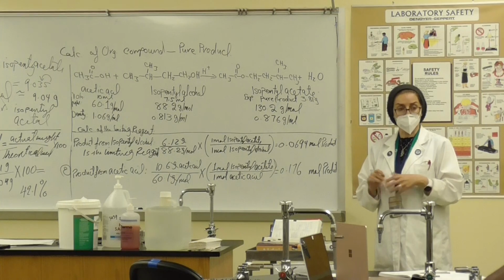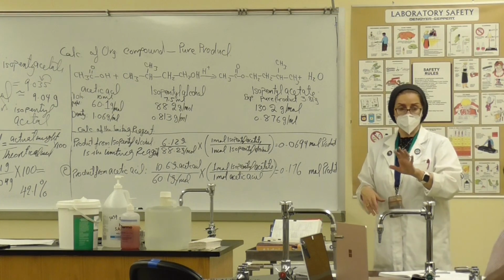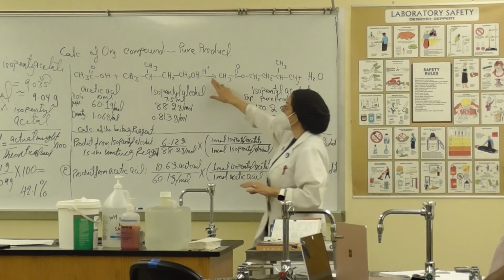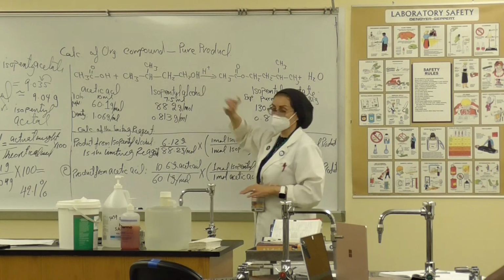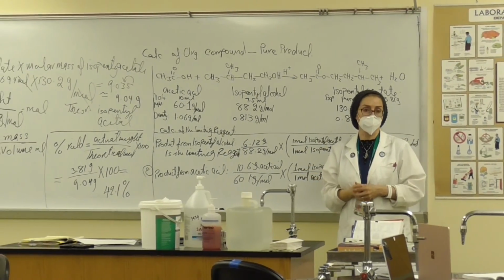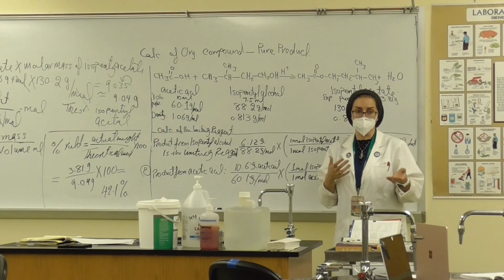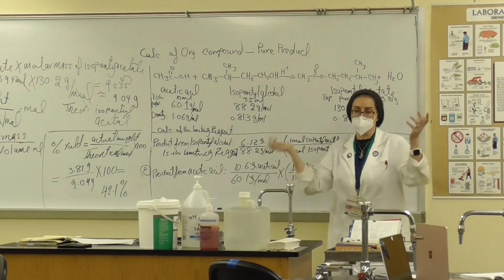Right. So this is going to be in first, and then also we're going to have a couple drops of sulfuric acid. Now, H stands for the acid, you should know that, everybody, right? So instead of saying H3O+ or H+ and H2O, you can always write it like that.